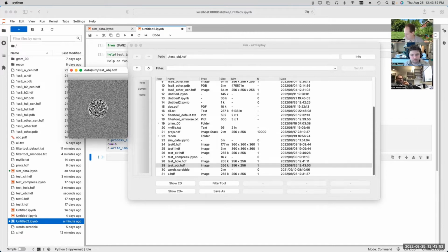What if you normalized the added image? Would it flatten? I normalized both of them. No, but after you add them instead of before. After you add, normalizing this would look exactly the same. It's normalized as part of the display process. The filter, I thought, is still a little bit different than CTF, but yeah, okay. No, the filter is different.